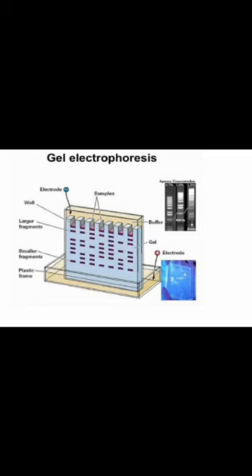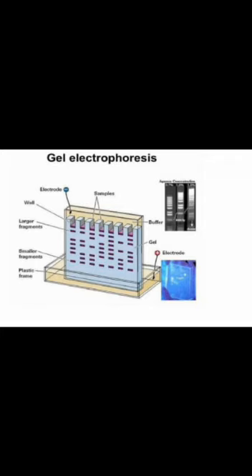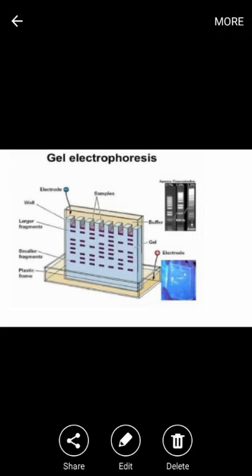And applications: DNA can be separated by electrophoresis to visualize bands of a molecular marker to genotype individual plants, to verify amplification by PCR or sequencing reactions, to check the quality and quantity of genomic DNA after DNA extraction, and to separate DNA fragments to clone a specific band.